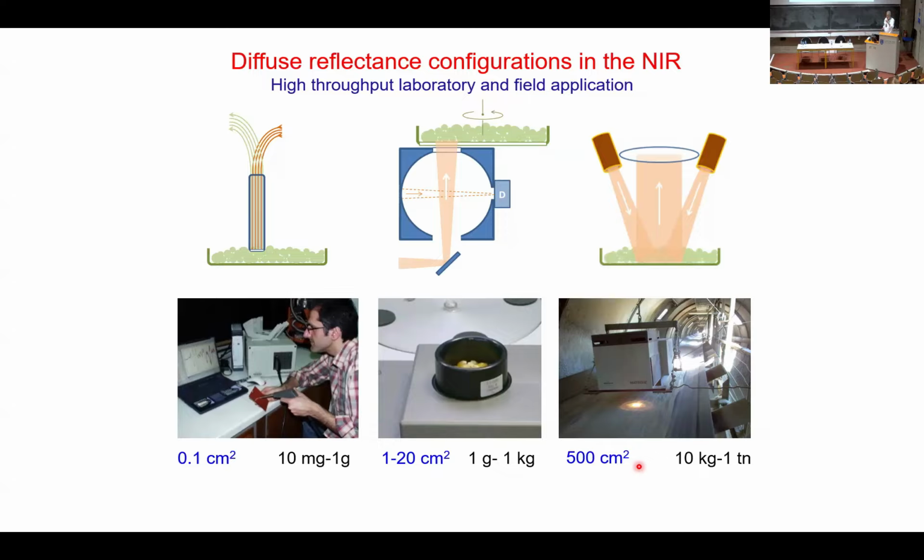I want to use water, the first layer of water, as a proxy for the surface that it's sitting on. So you can still do analysis even if there is free water on top of it, up to quite a big margin. We could measure material in a smectite bentonite mine, at least the one that I've worked with. The natural material is about 35% water. We can measure it at that state.